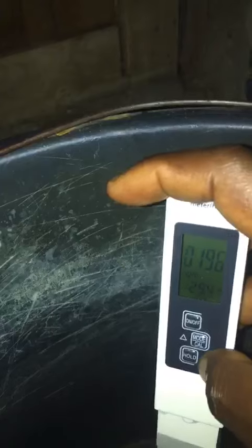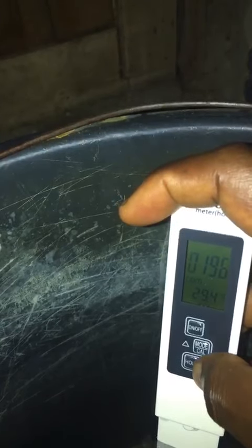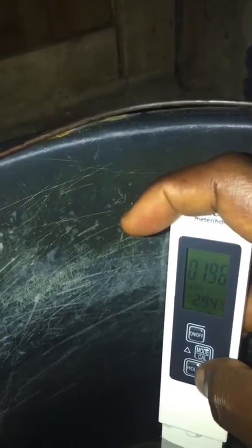When you put it inside the water, wait for the reading to stabilize. The TDS reading is 196. If you want to hold the reading so it stays, press hold and it will stabilize, then take your reading outside the water.